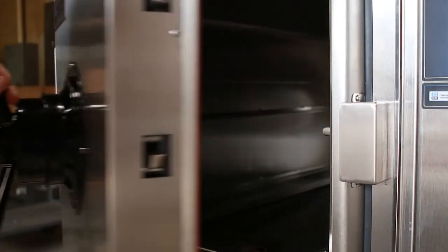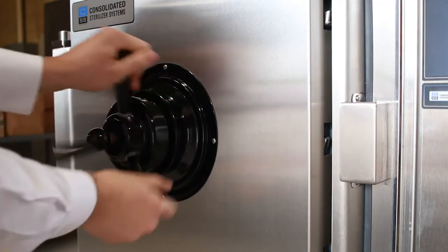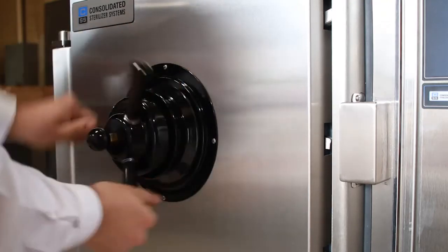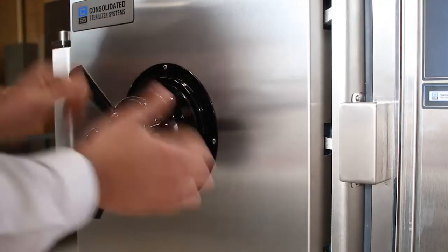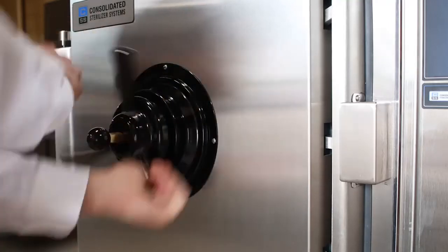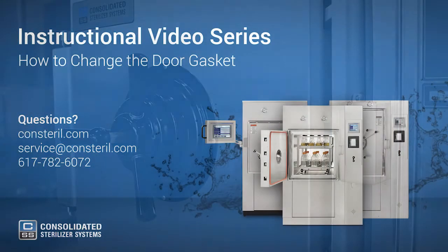Next close your door and lock it down. Do this lock down procedure a few times. Inspect your gasket after each time for gradual depressions on any material that was not fully seated in the groove.